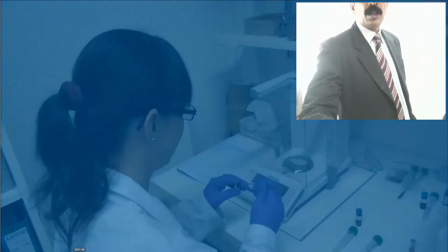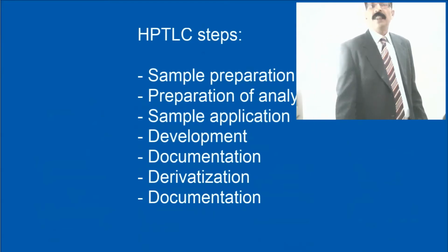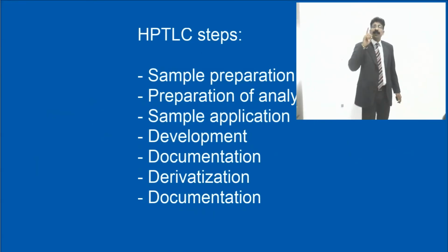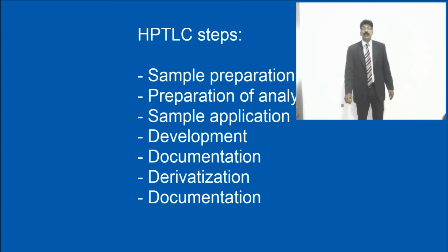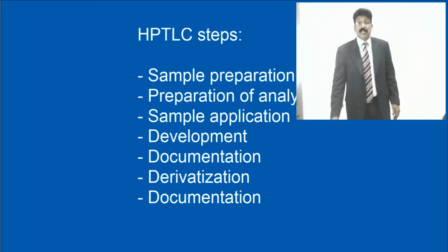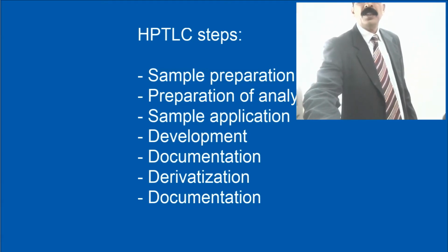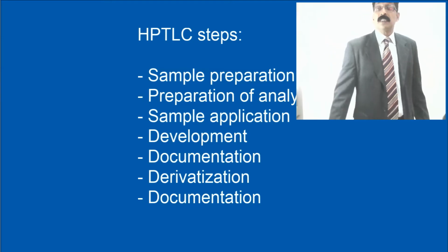This is the list you need to know, specifically for sample preparation: sample preparation of the analyte, that means the analytical substance which you want to prepare, sample application and development, documentation, derivatization and documentation. These are the steps which she is doing here. Once you know about these steps, it will be easy for you to understand.